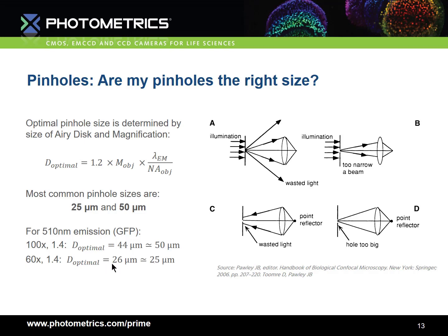However, what happens if we use a pinhole that's not quite the right size? In the case of a pinhole that's too small, as in A and C of this diagram, for the illumination path a too-small pinhole will diffract light too much. This light won't be able to be focused to a tight point in our focal plane by the objective, and will therefore waste light. Further, in the emission path, a pinhole smaller than one Airy disk will unnecessarily block light from our chosen focal plane as well, reducing transmission for no real gain in resolution or contrast.